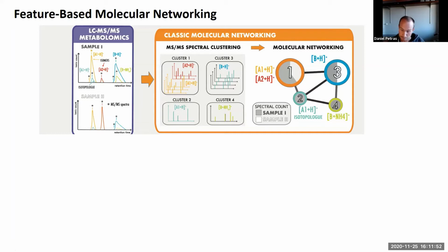relative abundance. But in a case where you actually have 2 isomers, like for your yersiniabactin, those are diastereomers, so we can actually separate them by chromatography, but they will resolve in the same MS2 spectra, so you may miss out here. And here I think this is really important. This is a really good example for the importance of inspecting your data later on. And I hope that the LCMS viewer will make this now a little bit easier.